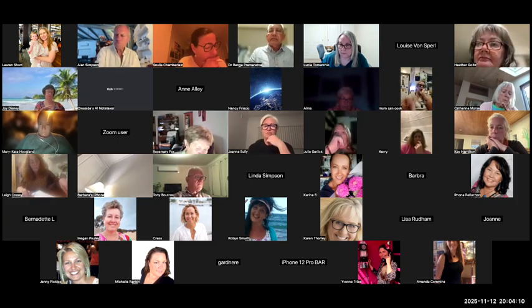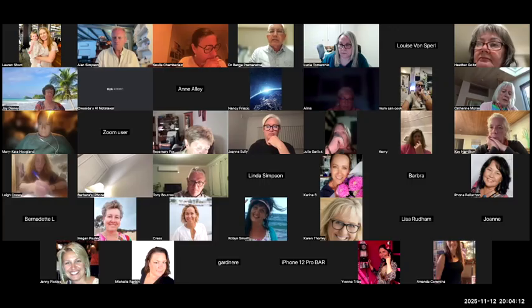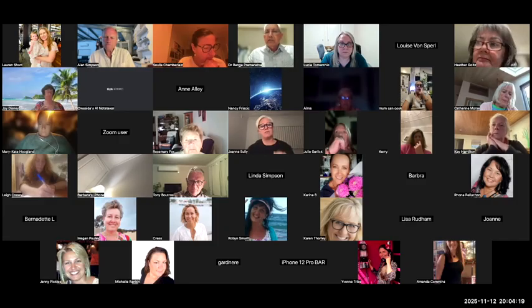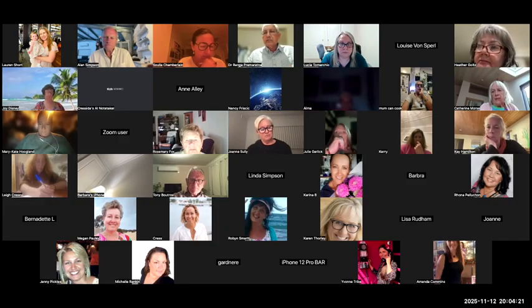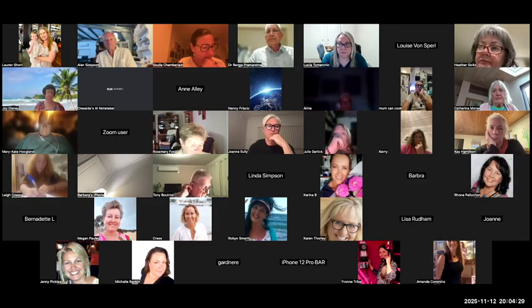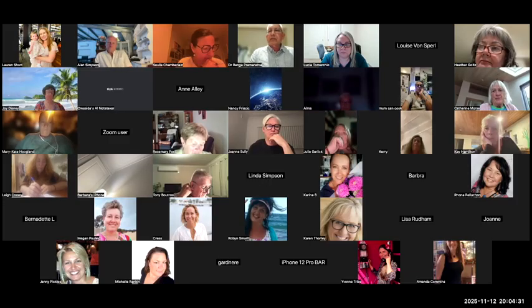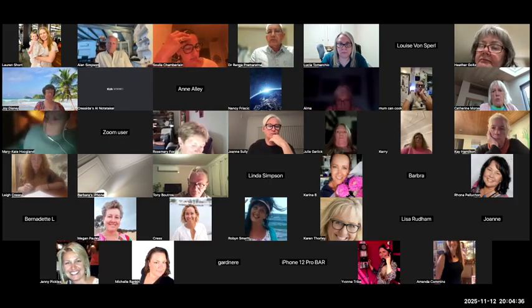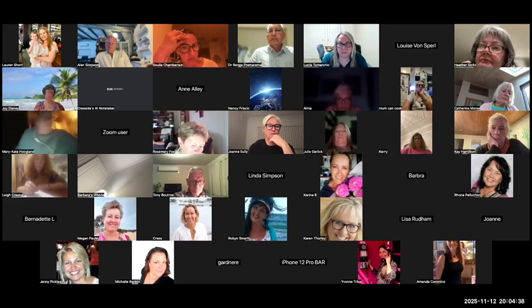So the stickiness of the blood. So once it's like that, there's oxidative stress on the blood. And then when that moves through the arteries, capillaries, and veins, it puts a stress on the whole system. So that can also be called oxidative stress, cardiovascular stress, and can cause neurological stress. So it starts with that red cell oxidation. That's where the first oxidative stress happens.